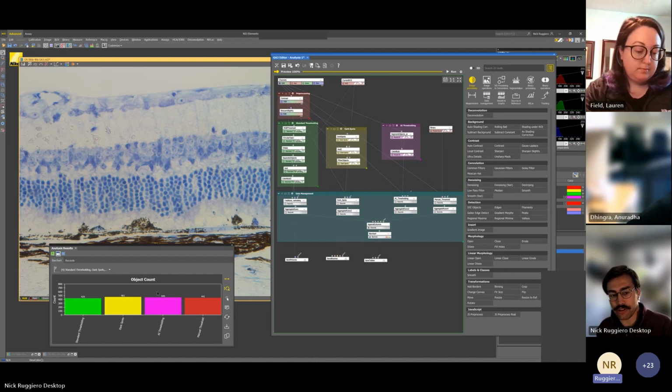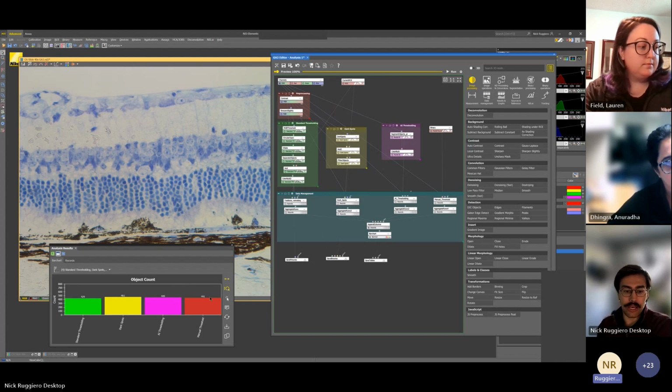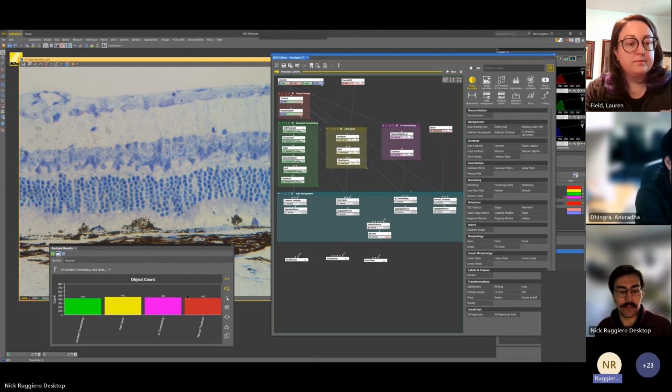I did 4 different thresholding methods here, and I wanted to measure how each one was doing. So all the way on the right is our manual thresholding. This is the one where I went in and I hand drew each of these little object binaries. And this is the binary that I used to train the AI on, which I'll show you at the end of this section.